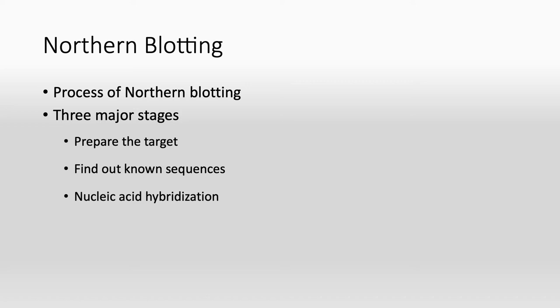For example, RNA is present inside the cell, in the cytosol of the cell, or inside the nucleus. So what we can do here, we simply extract the content of the cell that should contain RNA. In case of messenger RNA or mRNA, the content of mRNA is present inside the cytosol, so we extract that part of RNA, and we have an RNA mixture which is the whole RNA mixture of the cell.